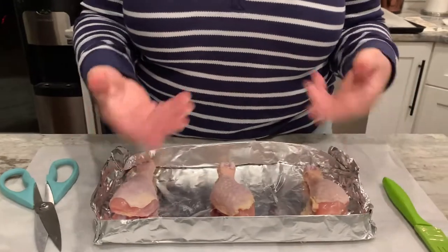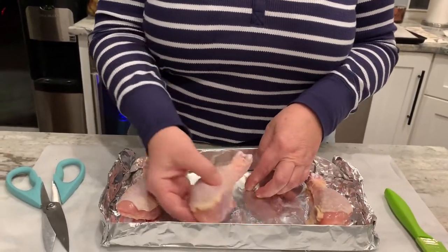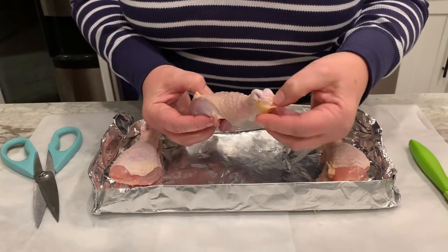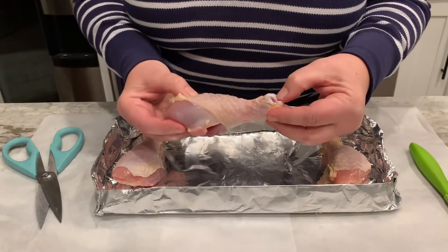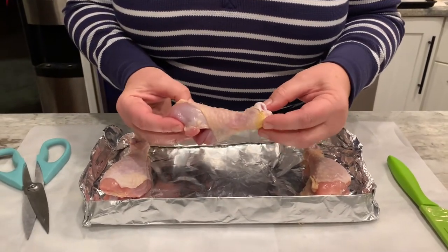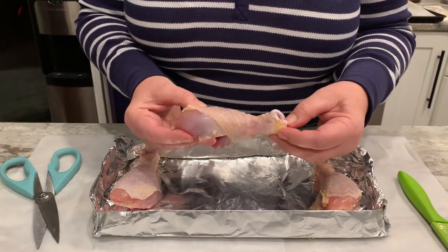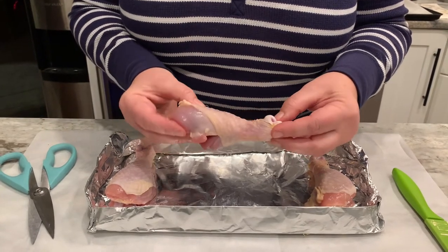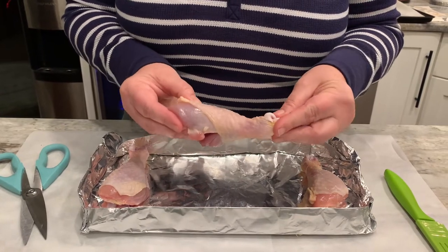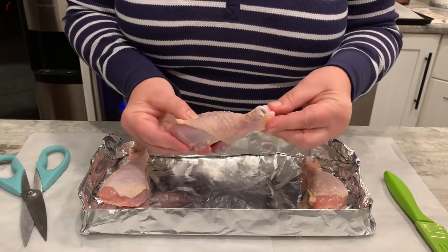Let's first look at the joints. This white, shiny connective tissue is hyaline cartilage — it wraps around the distal and proximal ends of the bones to form the joints, providing gliding motion and protecting the bones.